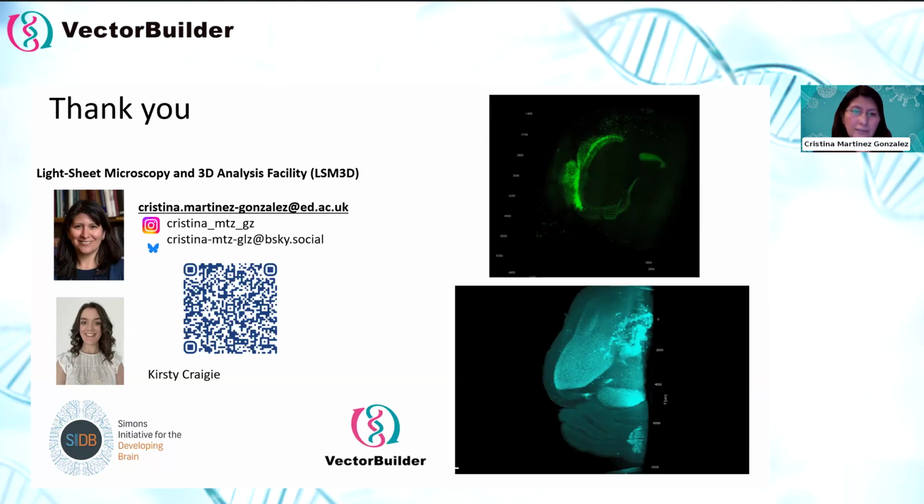But because they are precious samples, I would say solvent based. Our protocol, we have that and we have 1 or 2 samples of human brain. But yes, we do skin, muscle, and brain. Nice. And I'm happy to help anybody who wants, they can email me and we can share our protocols. No problem.